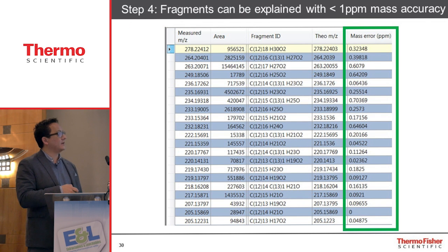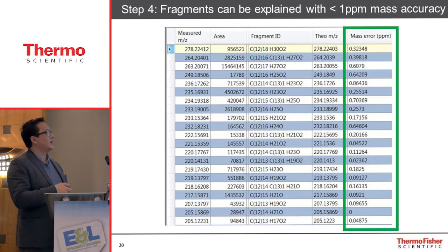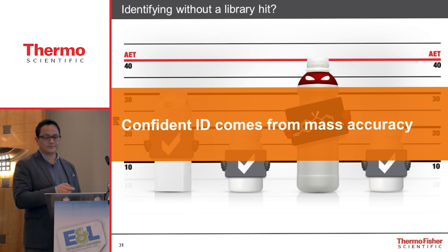And again, what we're able to do with MSMS that can be automated is you can take that molecular ion, you can fragment it again if you want for absolute confidence in that. So here's a fragment ion spectrum of that molecular ion with the results showing all of the mass errors significantly below 1 ppm.